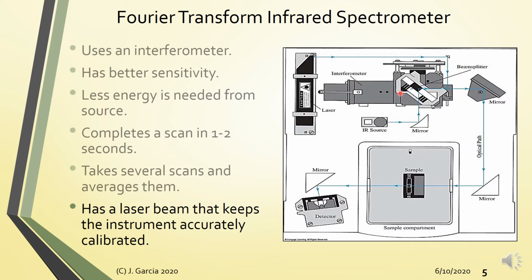Usually, most FTIR instruments are equipped with internal desiccators with indicators din. So yung desiccators na yun ay pinapalitan after magpalit ng kulay yung indicator. Alright? So consumable yun. Ang IR source, yung light source, this will usually last you around 2 to 5 years. Depende sa usage. Yung laser source, ganun din, around 2 to 5 years. Mag-a-alarm na mag-notify naman yung instrument kung kailangan ng palitan. Okay? Ayan. So this is your FTIR spectrometer.